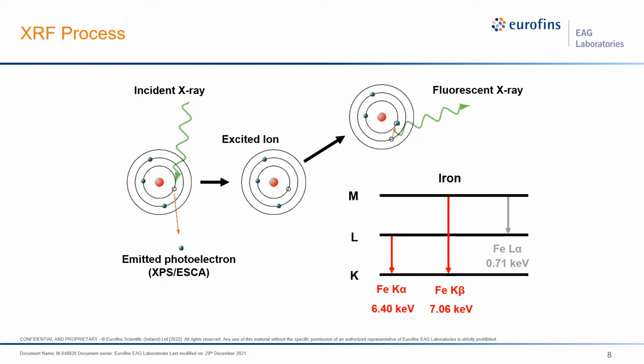And if you go to the left and look at manganese, you see that the manganese K alpha and K beta energies are lower than that of iron. And this is the trend that we follow across the periodic table. And all of these energies and relative intensities of these photons are well characterized, and that's how we can quantify the results. So we've talked about XRF.